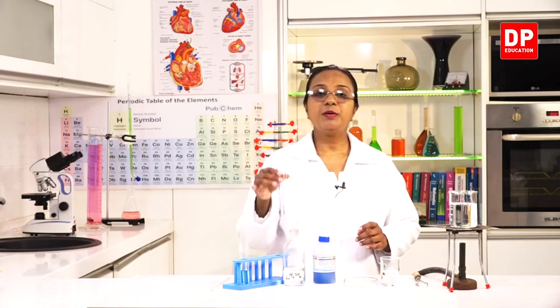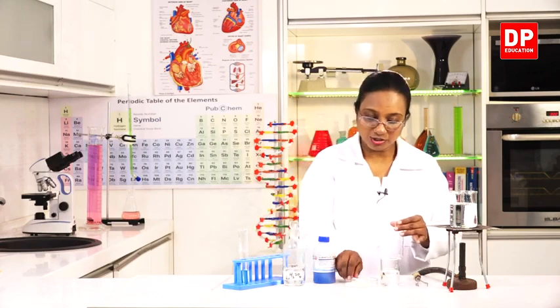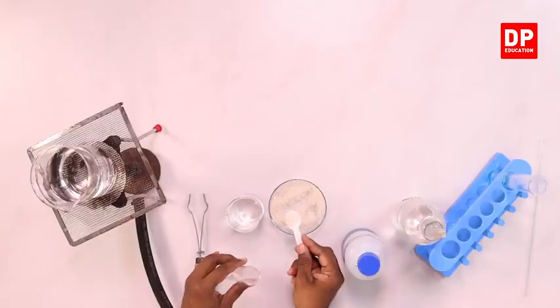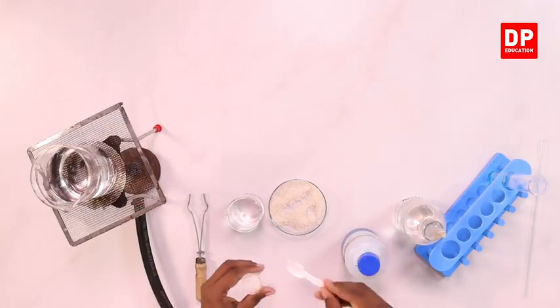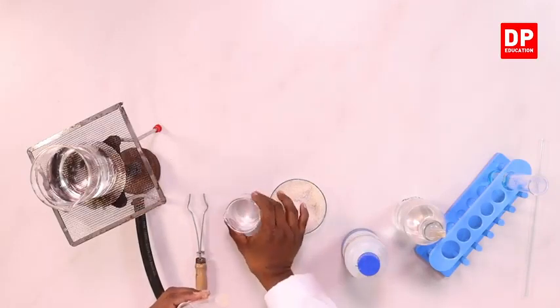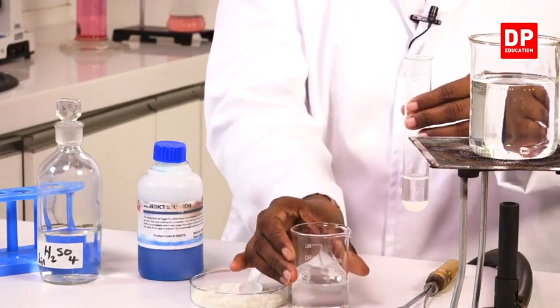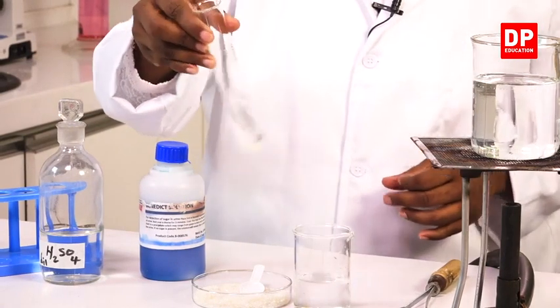Now I am going to prepare another solution of sucrose. The sugar has to be taken into the boiling tube again. And when I add water, we get a freshly prepared solution of sucrose.